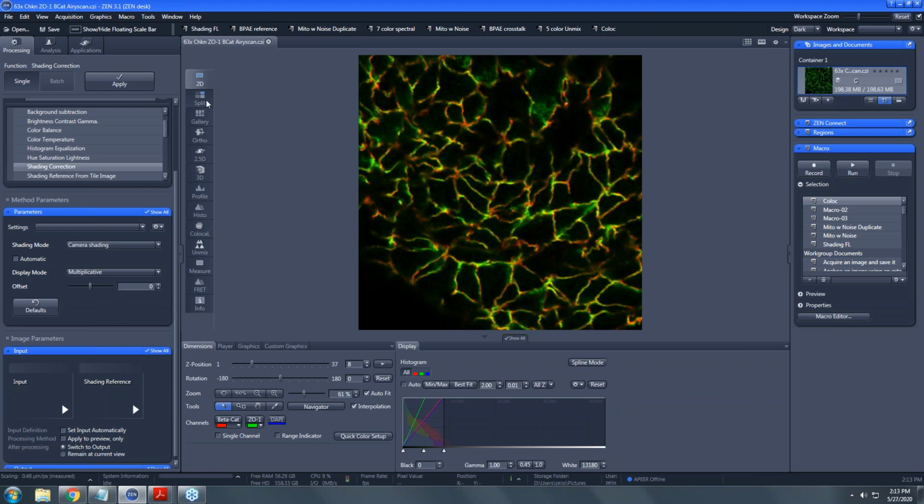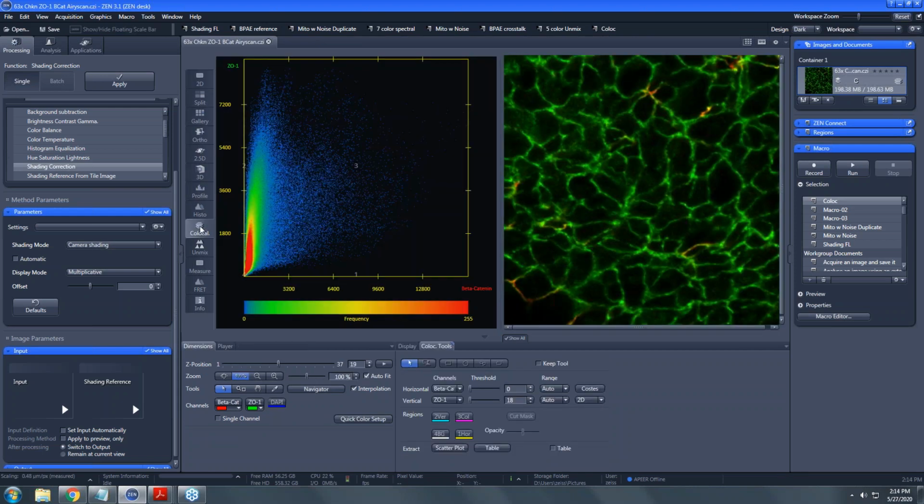But it can be difficult if you're comparing sample A to sample B, drug treatment, or a wild type versus mutant, something like that. If all you've done is disturb the degree of colocalization, then it's rather difficult to convince somebody that you have more or less orange. So in that case, you want to be able to quantify it, and you can do that through the colocalization tab that's on the left-hand side of the image, about 2/3 of the way down there. Yep, terrific. So we're in colocalization, and we can see this scatter plot now.